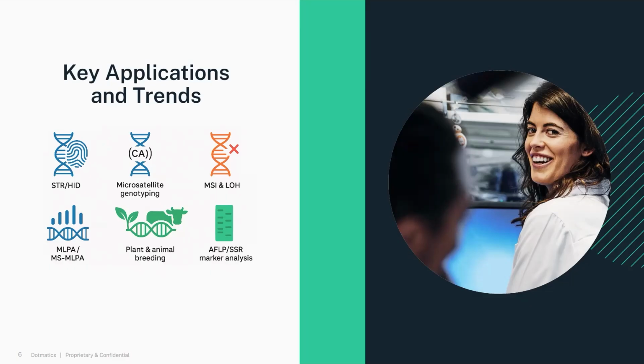DNA paternity and familial testing provides absolute confirmation of parentage, as written records can be manipulated, but the STR pattern of an individual cannot. DNA analysis for microsatellite instability, loss of heterozygosity, and copy number variants involved in cancer development are important tools in hospital laboratories, with MLPA and MSMLPA used either initially or as confirmation of results from MPS or next-gen sequencing screening.